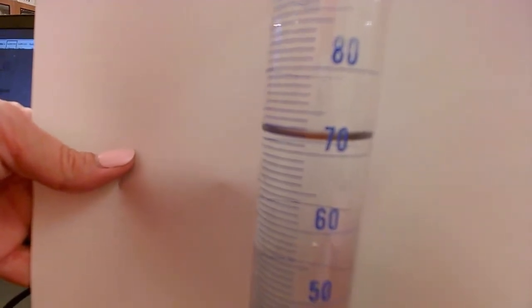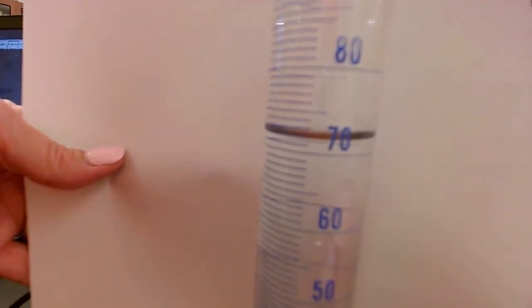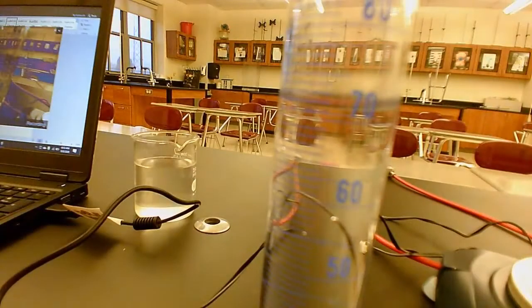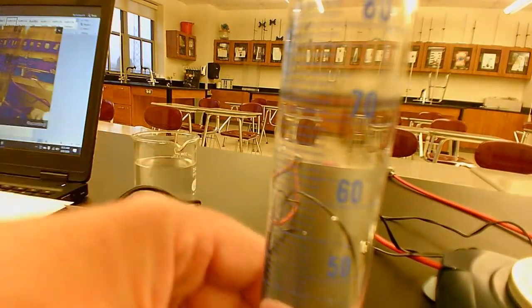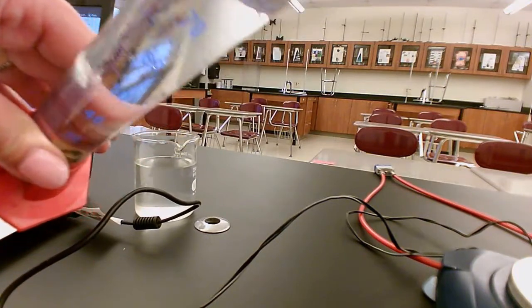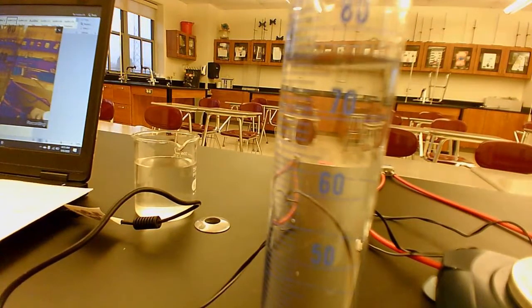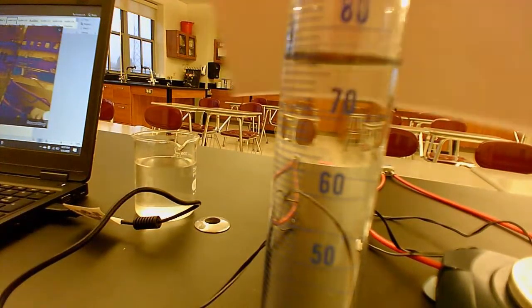Just a reminder for your volumes, take them to 1 decimal place. That's a guess, so your decimal place might be different from another person's. Now we are going to slowly, I tilt it so I don't smash the bottom. And now we are going to see what the volume of the water and the solid is.